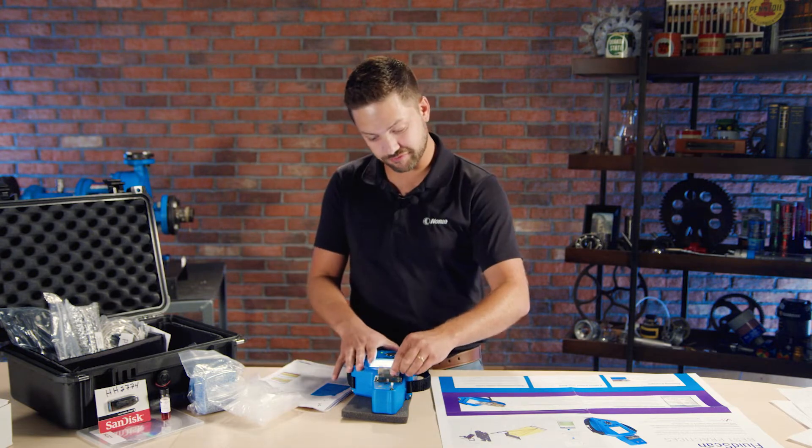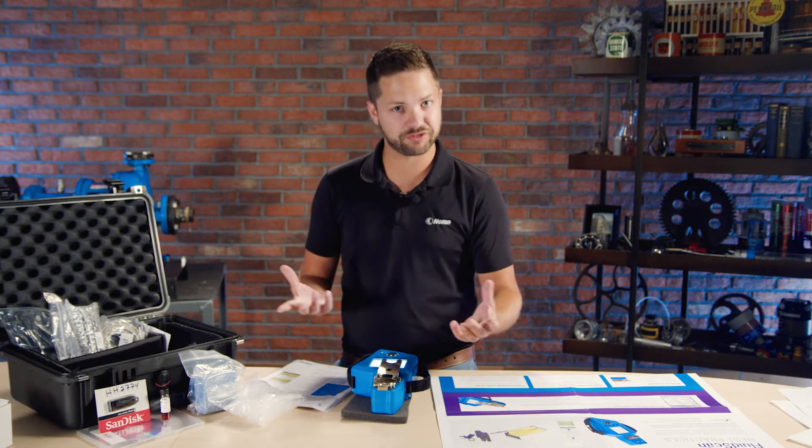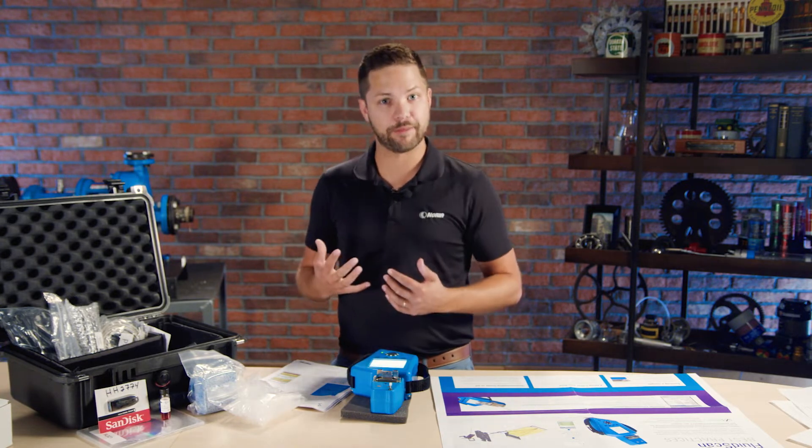There's a little flip-top that you open up and you drop in oil — I'll demonstrate it in a minute. Once you put it in, it's going to take about one to two minutes to run the analysis and it gives you all these parameters.